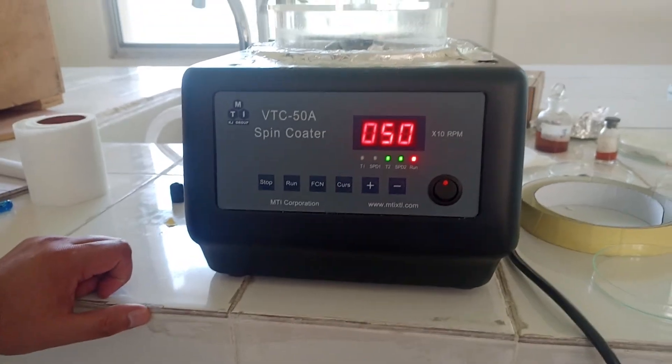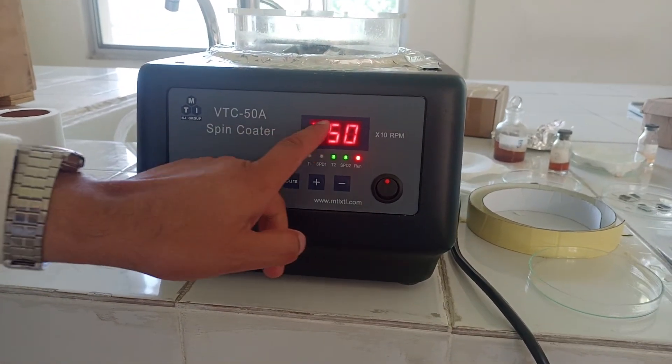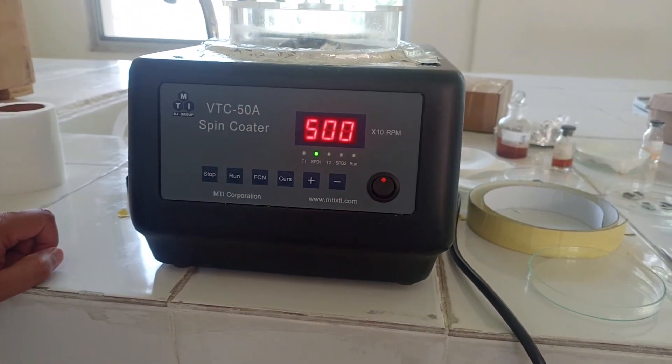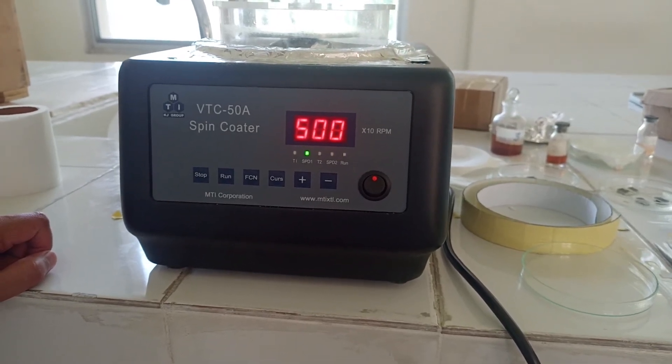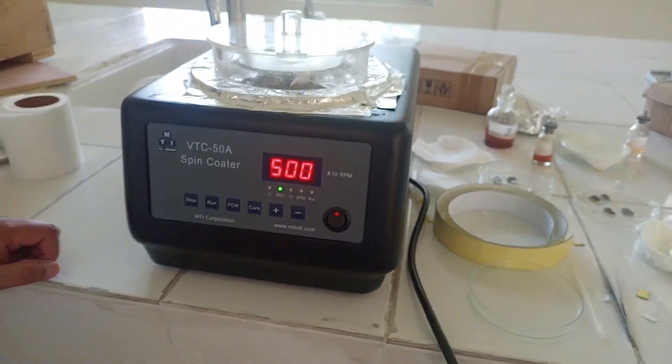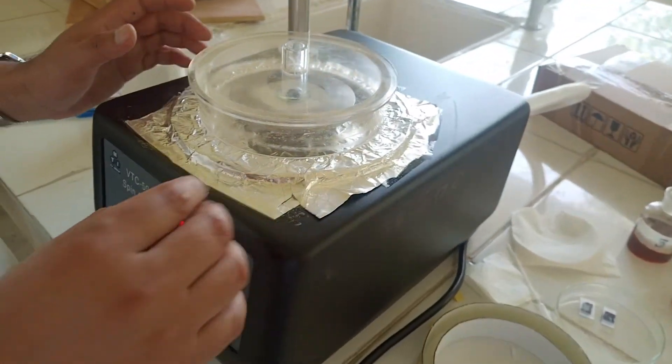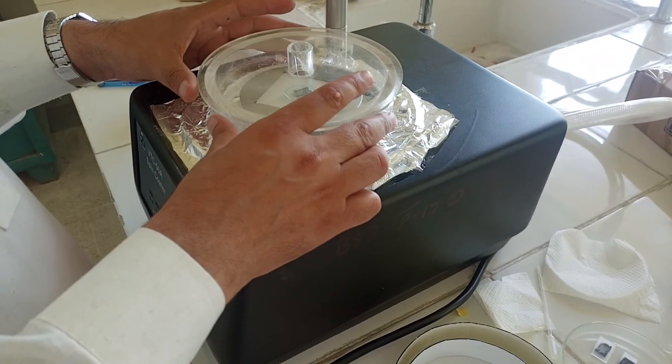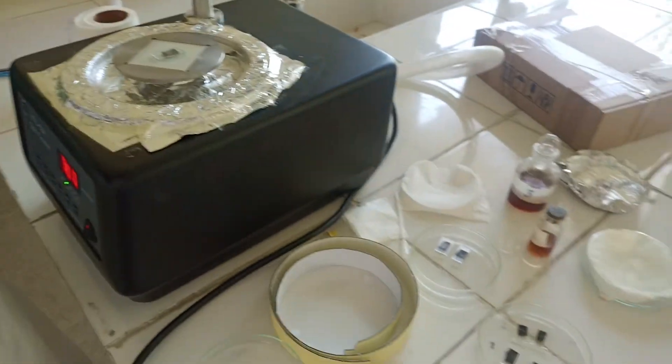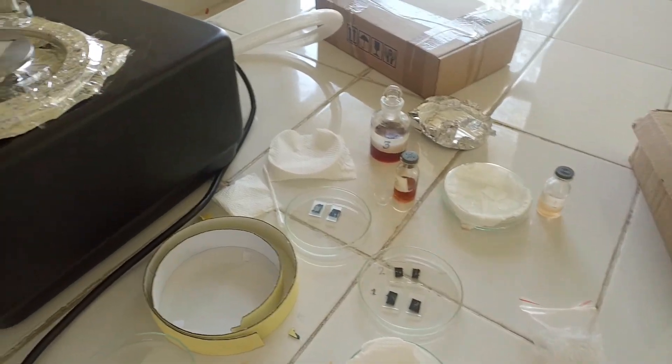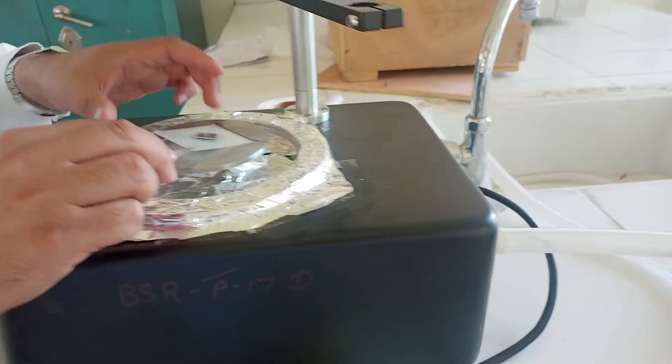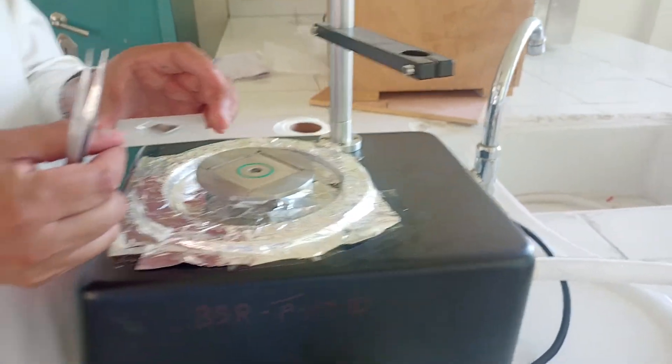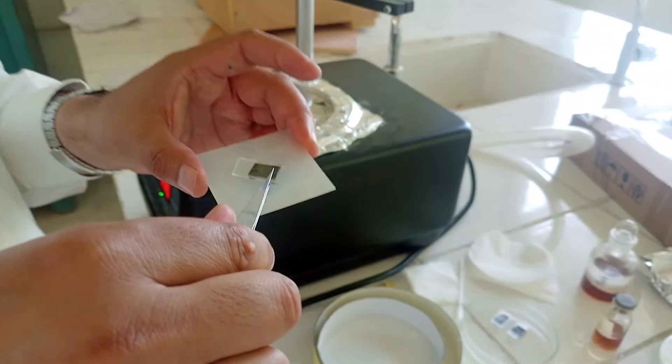This is our display. This display shows our revolution and time. Now it has been stopped. We will put off our lid after it has stopped, and then we will remove our slide from this. We can take it out.